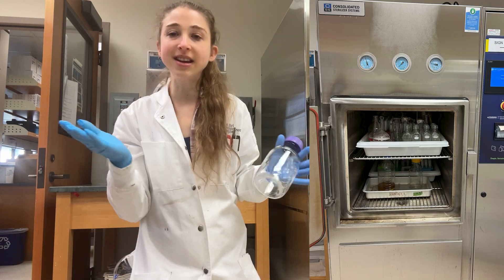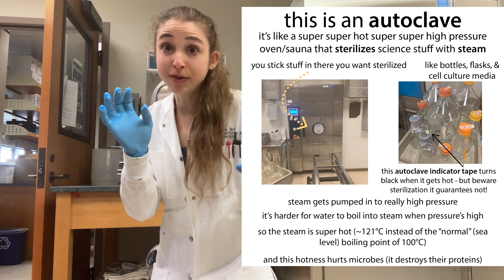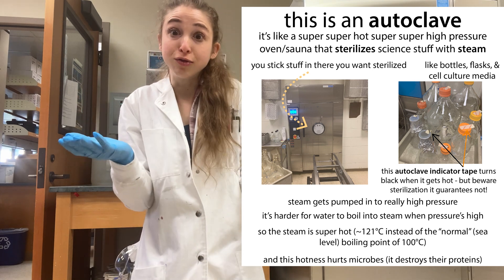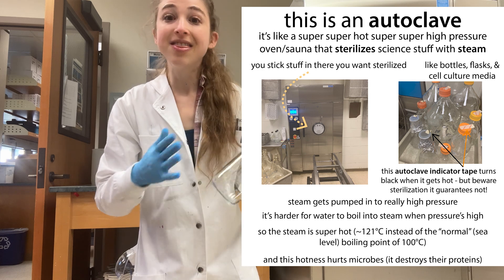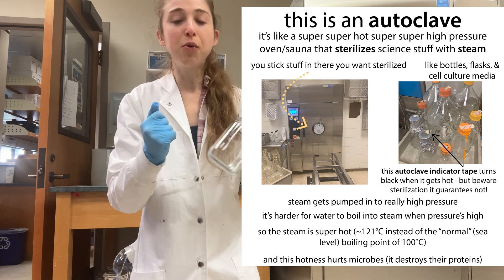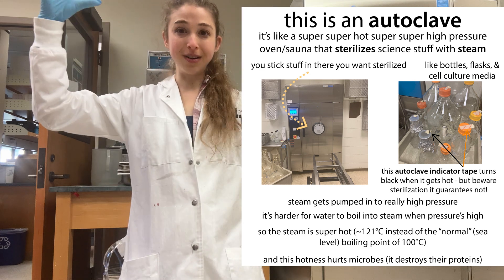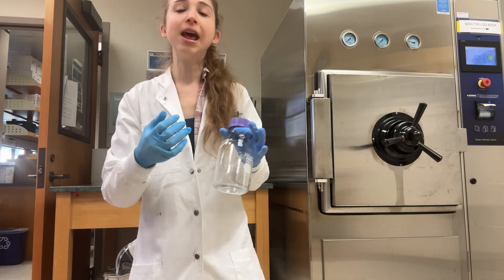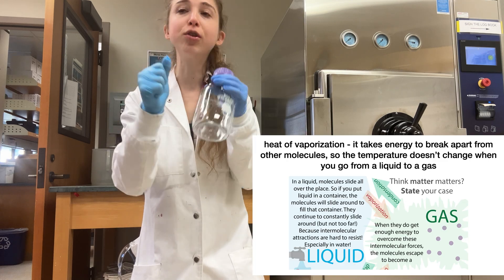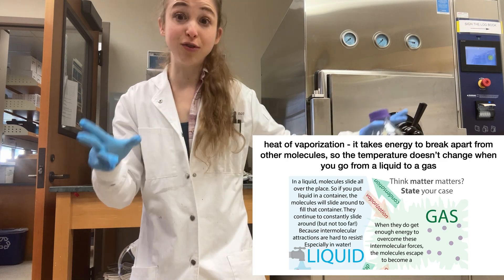This is an autoclave and it's basically a giant pressure cooker. What it does is it gets really, really, really hot, and the way it's able to get things really, really, really hot is to get the pressure really, really, really high. This allows you to get really hot without having liquids boil and evaporate. The way it works is it uses steam — water vapor — and you can hold more energy in that water vapor than in just dry air.